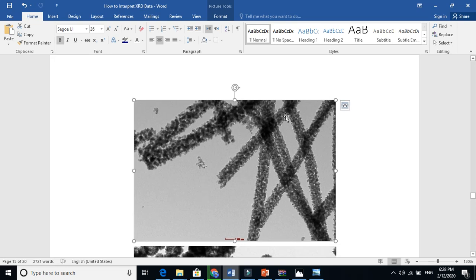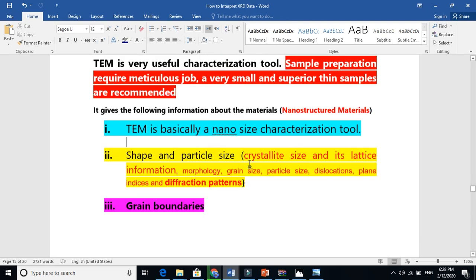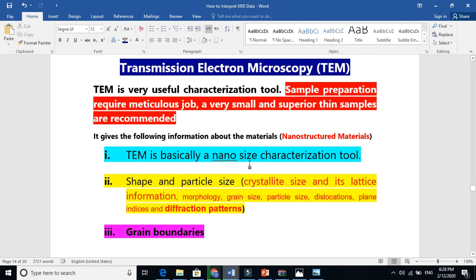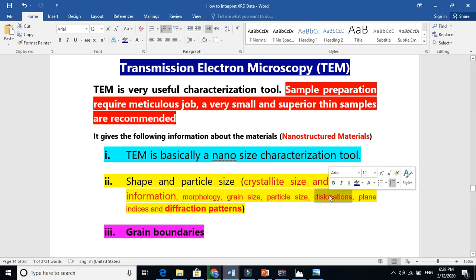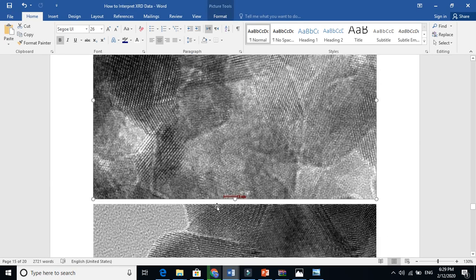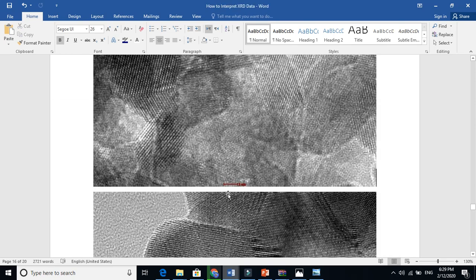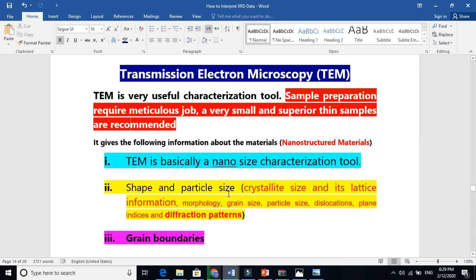Looking at morphology: it looks like nanorods here, and the second image looks like particles. At low magnification, TEM works just like a scanning electron microscope. It reveals grain size, particle size, dislocations (meaning defects), indices, and diffraction patterns. If we change the mode into high-resolution TEM or diffraction mode, it gives us the diffraction pattern, from which we can determine whether our material is polycrystalline, single crystalline, or amorphous. It also gives grain boundary information.